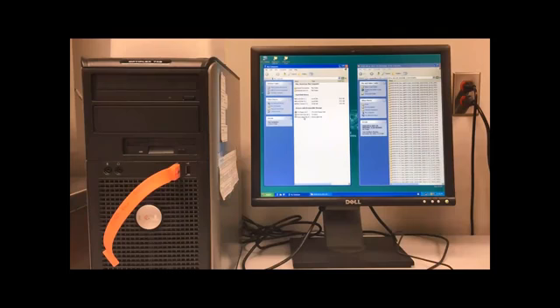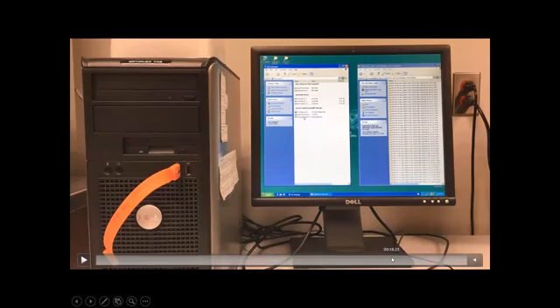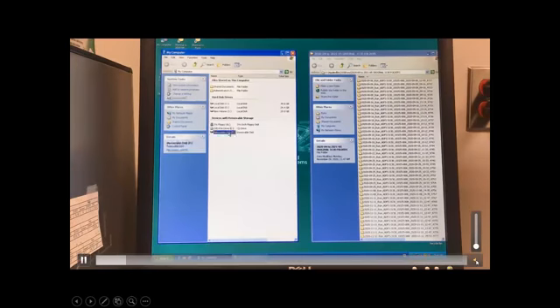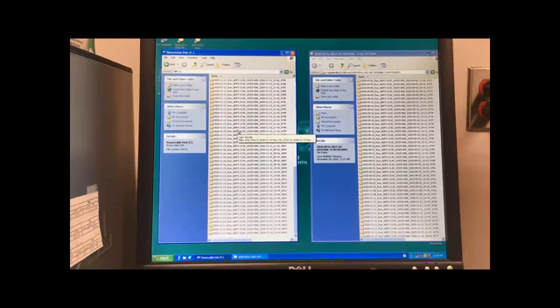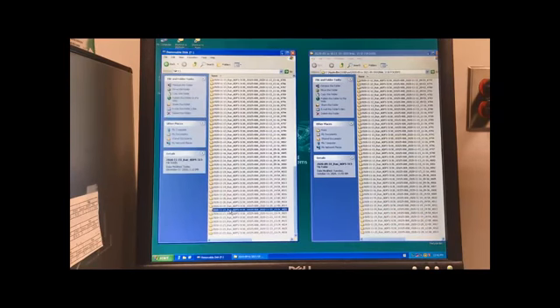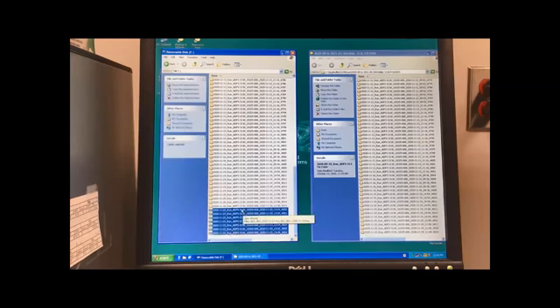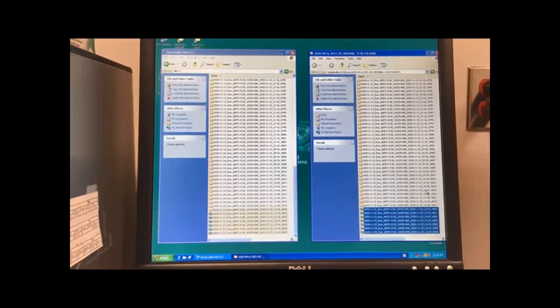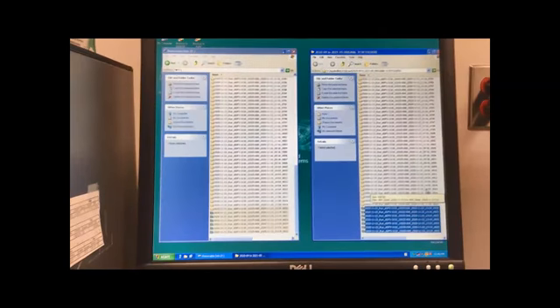If we scroll down, and let's zoom in closer here, you can see that we have everything all the way down, including November 23rd, whereas on the computer, the original 3130 folder still doesn't have that 23rd. So I'm going to hold down Shift, copy these, and now we're going to have a mirror. What's on the data collection computer is exactly the same as the USB drive, and now it's exactly the same as that 2020 to 2021 original 3130 folder.